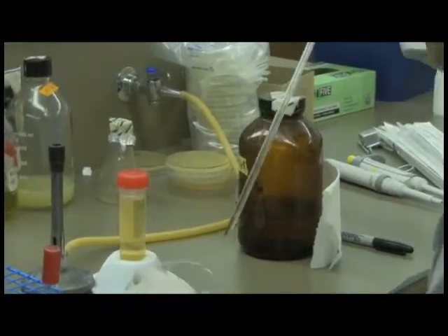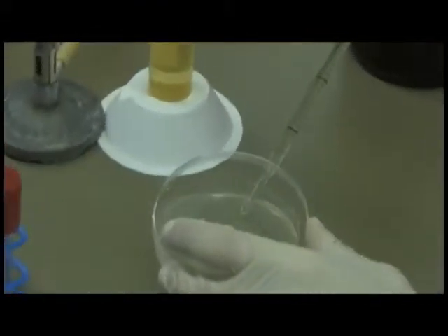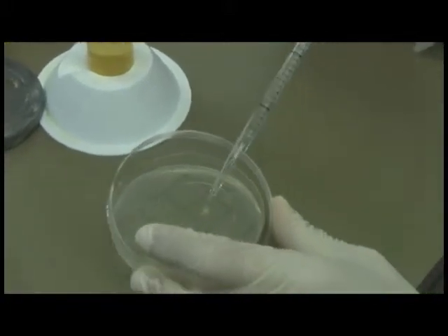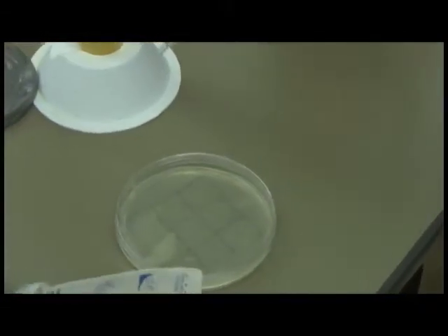And then we'll put it on our agar plate. I usually like to cover up the plate with the lid just so you avoid contamination. So you put the agar in. Notice we got a bubble here. We'll need to suck that up because bubbles can look like plaques, and that can make your results difficult to analyze.